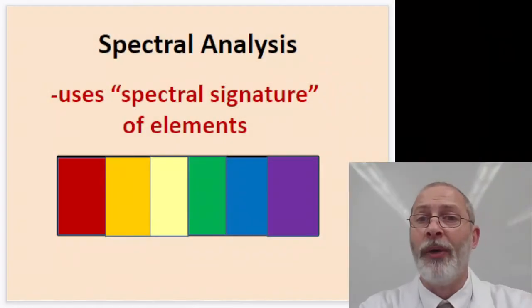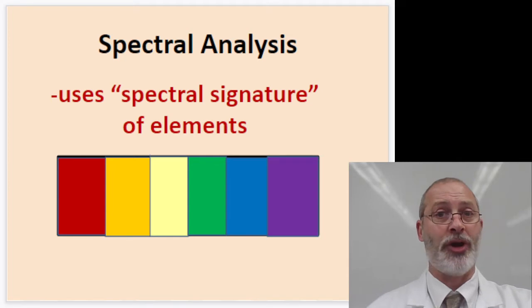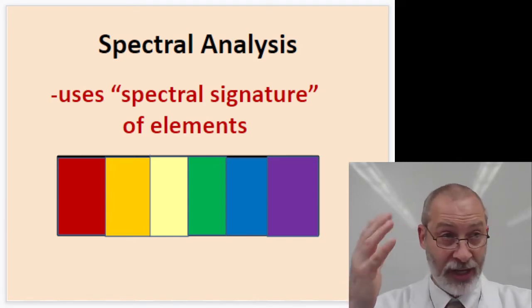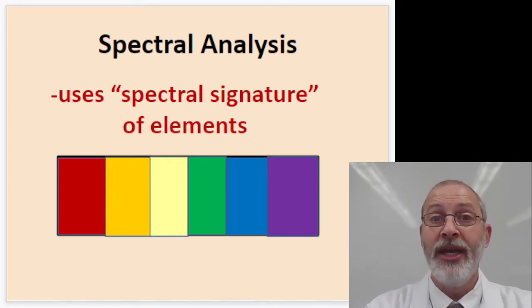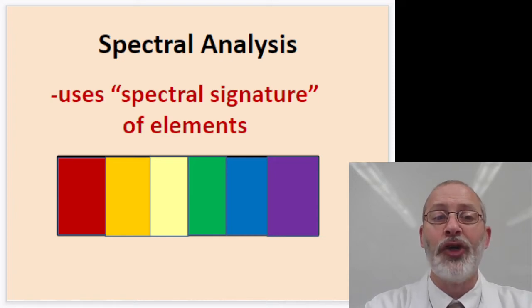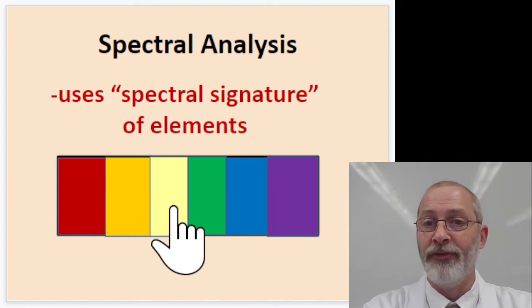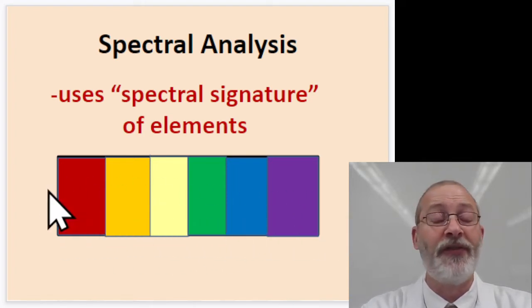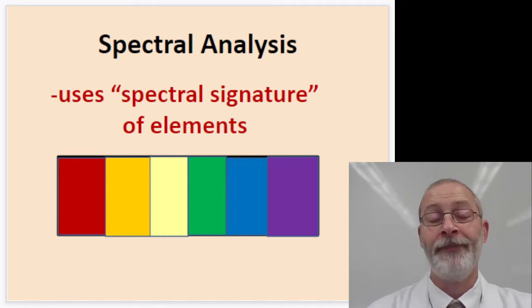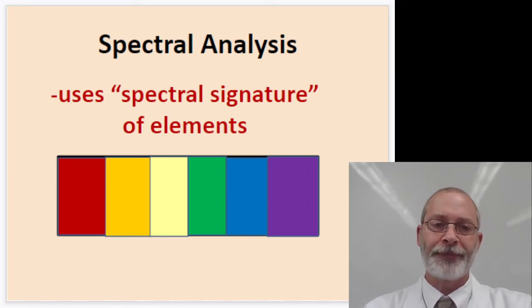Now, what are we going to observe? Well, with a full spectrum, in other words, like sunlight that we might examine or the lamp light that we'll see as soon as this video is over, we're going to see a full spectrum of colors, Roy G. Biv, a full rainbow of colors, such as the light that comes out of the lamp that we're going to start off with.